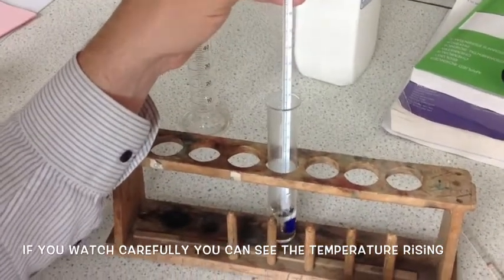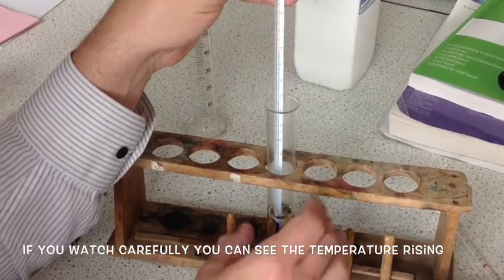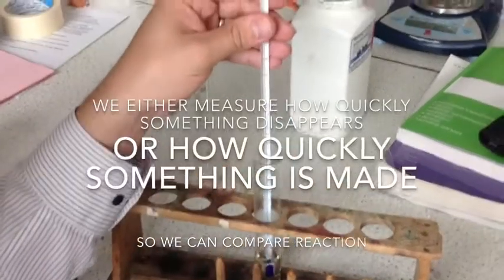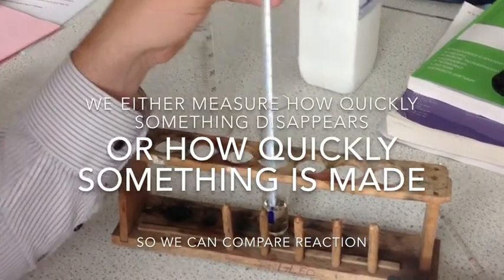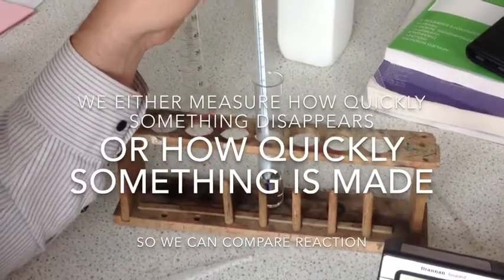And this is just another way. You can't see anything being produced in this reaction. There's no sign of any gas being produced. There's no visible change at all. However, it is significantly hotter just by adding water. So we can measure things. We can measure production of energy. We can measure change of colour. We can measure production of gas. Anything, when you do a rate of reaction, it's either about measuring something being made or something being lost.